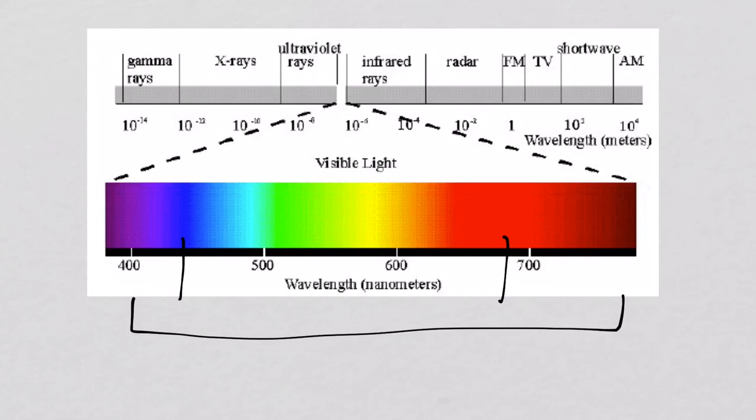They jump down. How do they release the energy? Through heat. Or they send out light again, which is called fluorescence. But they usually jump back onto the next level. So that's actually how radiation interacts with substances.